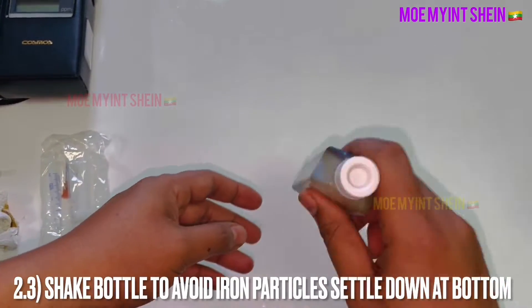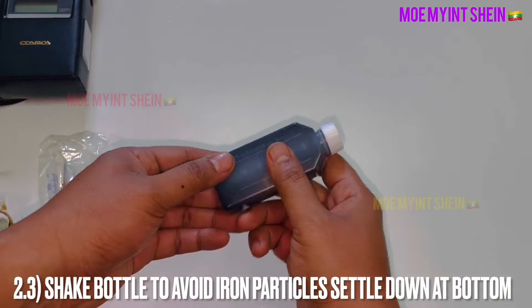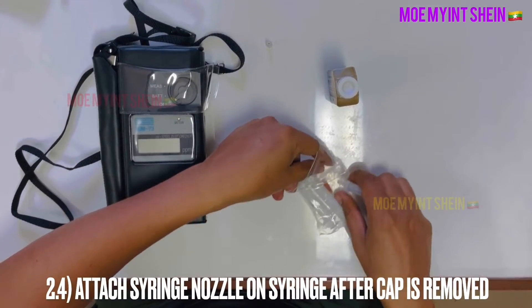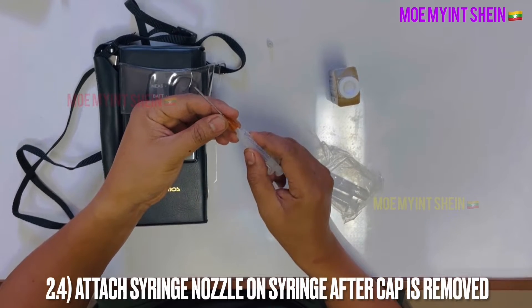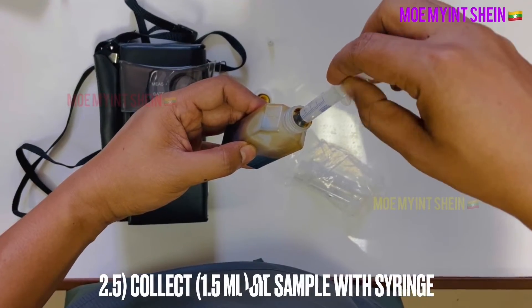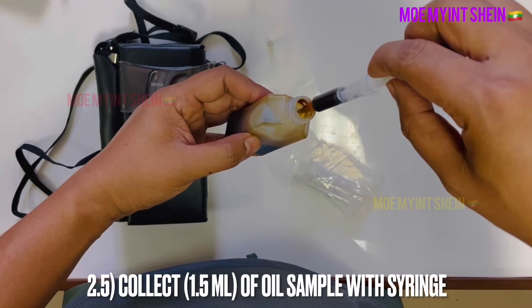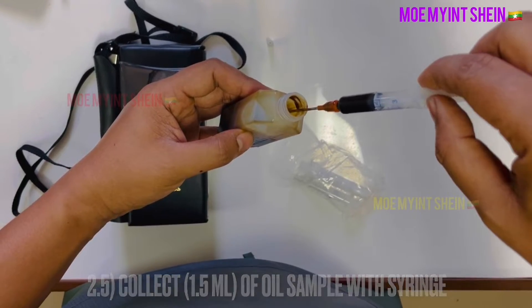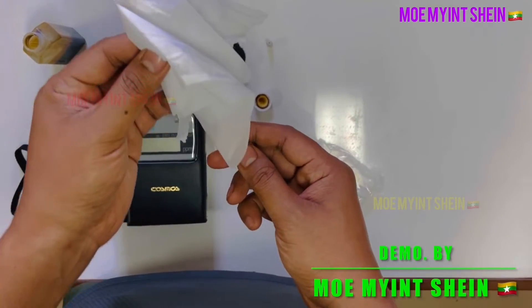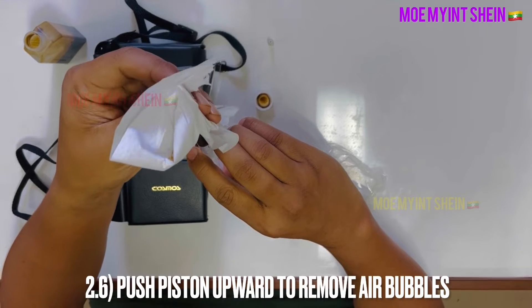Shake well to avoid iron particles settling at the bottom of the sample bottle. Then attach the nozzle on the syringe to take a sample from the bottle. Draw 1.5 milliliters of oil from the bottle. To remove air bubbles, push the piston of the syringe upward.